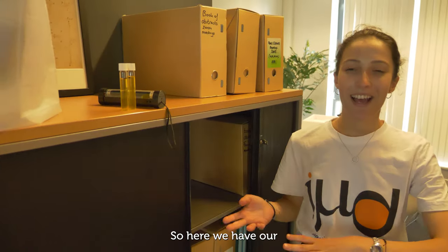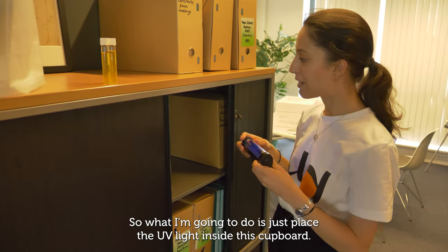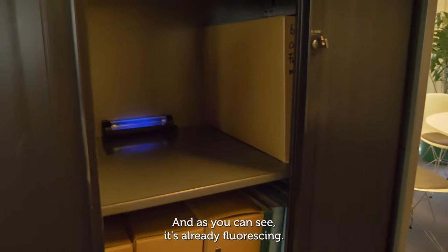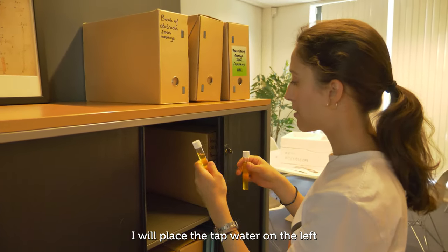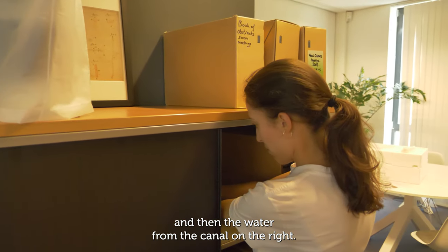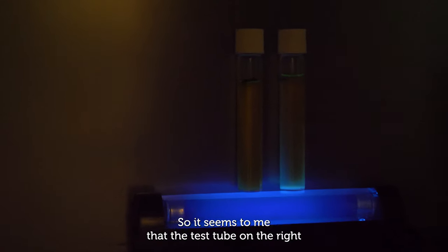Here we have our little dark room set up, because the lights don't switch off. I'm going to place the UV light inside this cupboard — as you can see, it's already fluorescing. I'll place both samples on top: the tap water on the left and the canal water on the right.